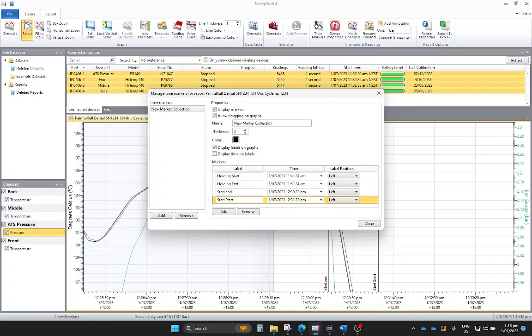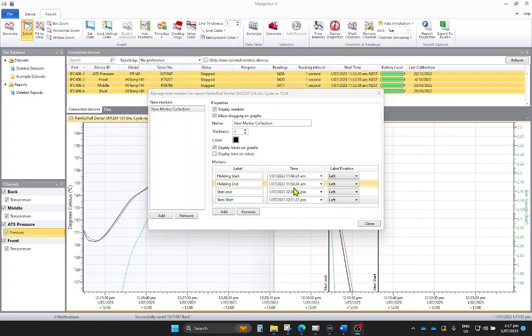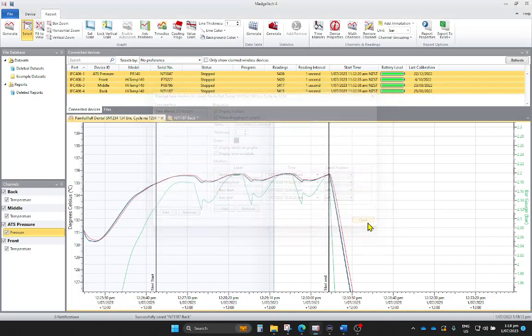I'm just going to pause the video for 2 seconds while I do my maths. And we're back. So 12:50, 6:22. Sorry, 12:26. Cool, so we'll just remove that last one, so we'll close that. Cool, so there's our points that we've got.